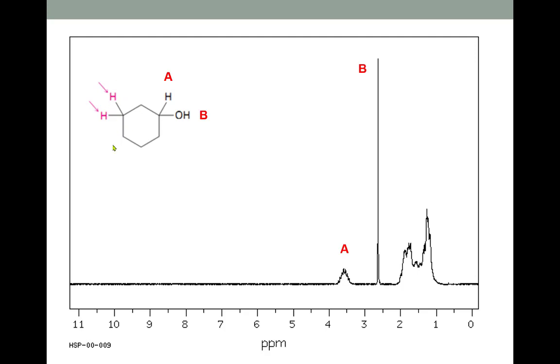Now, the rest of this ring, there are two hydrogens shown in pink, obviously, but there are two hydrogens on each of these carbons. And so we have, by symmetry, one group of hydrogens. Let me turn on a pen here so we can go up and label these. We have one group of hydrogens representing the hydrogens on these two carbons. By symmetry, these would be identical. So we have that one group there. We have the second group here. And we have a third group, another symbol here, right? So on paper, at first glance, we might expect 3 signals from this.